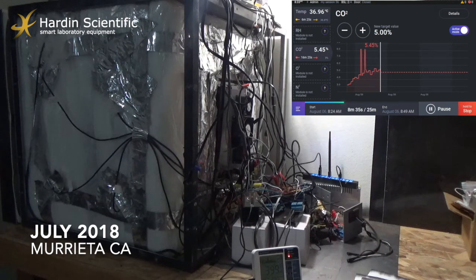with this range, and for example, to add gas into the chamber slowly, right, to make sure that we have a very tiny range around the target. It's fine, so we can select different modes, how aggressively we add the gas inside the chamber.